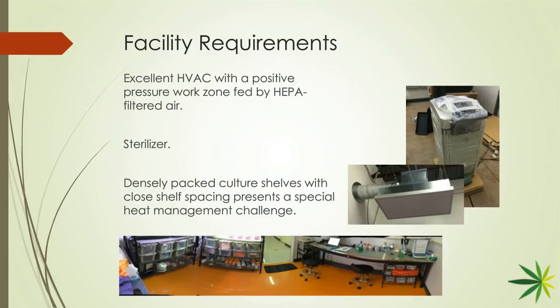The only exception to that footprint is that little sterilizer that I've got in the upper image. That had to be in a different room purely for facility requirements. But that's basically just a fancy pressure cooker that is very efficient and safe and faster than a pressure cooker and more consistent for sterilizing the medium and getting everything clean. You can do it that way because you seal your stuff in a jar, walk down the hall, drop it in the sterilizer, and bring it back while it's still sealed in the room.